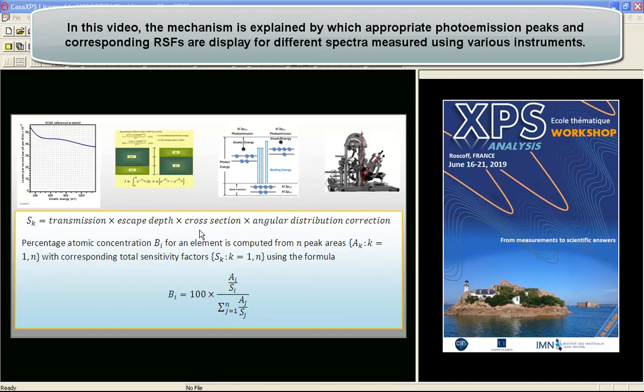Once all of these have been combined together, we end up with this total sensitivity factor that can be introduced into an atomic concentration calculation. This relates the areas by dividing by these sensitivity factors to the total signal obtained by summing all of the areas involved in the calculation, all scaled by these sensitivity factors.